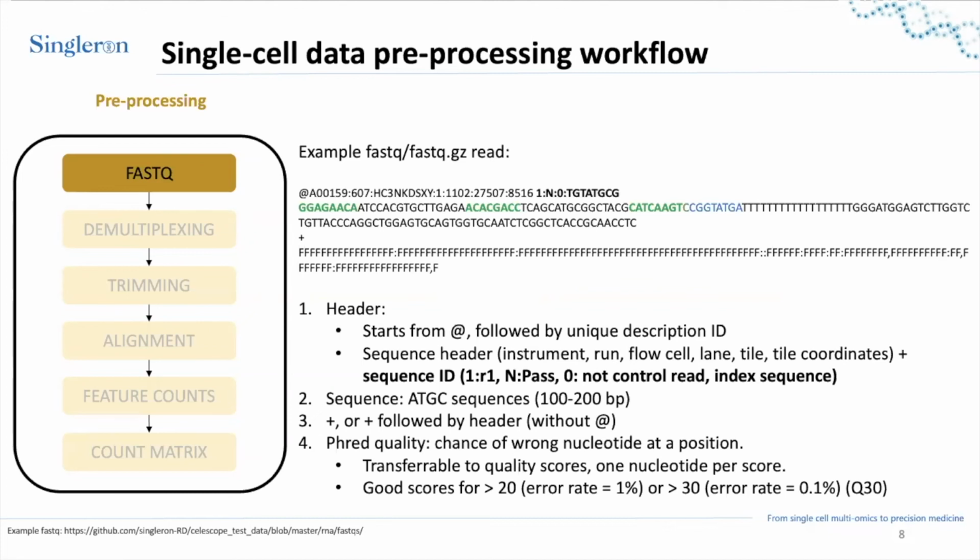For example, regardless of single cell, short read or long read, different sequencing technologies may introduce different error rates. When this happens, we may expect different quality scores returned from different Fastq files. I hope that answers.